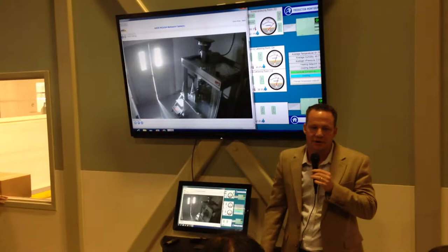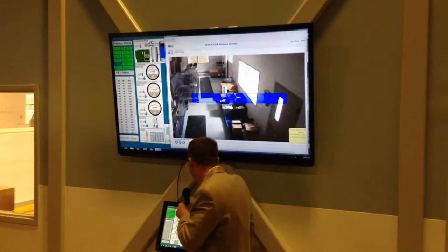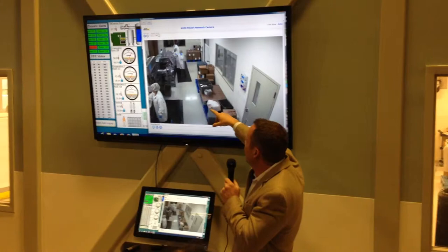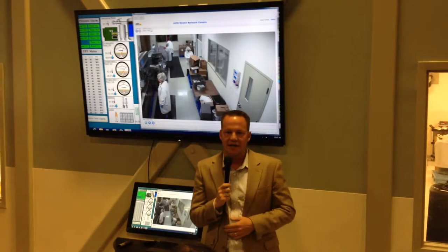So we take those capsules — you can see an example right in this room. They're running their blister cards. You may not recognize that product; you'll find out about it at the convention. This is our blister machine, and it's actually running the new product. It's a wonderful product. We've tested it for over a year, and a lot of us internally tried it. In my opinion, it's one of the best, if not the best, products that ZJ has so far.